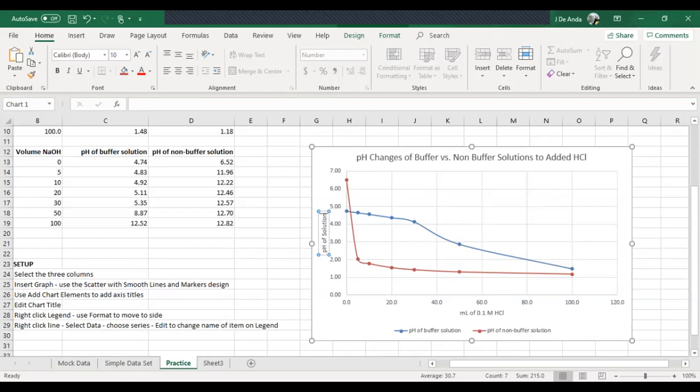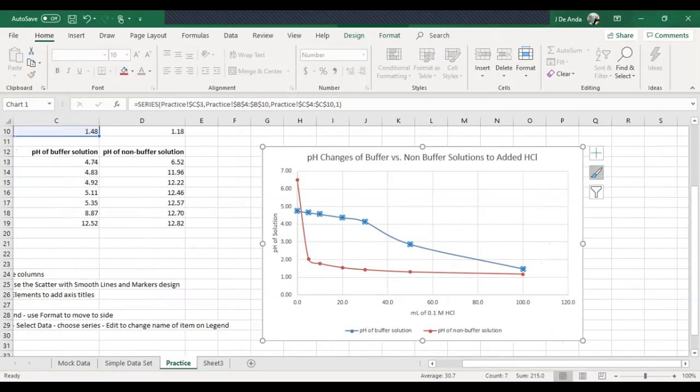All right. So the other thing I want to do is, right now it's fine. This is pretty good. I would like to maybe change the markers. If I'm going to print this to a black and white printer, I might want to change the markers on these. And I think the way you do that is you click on the graph itself here, and then you can edit the format here. I forget where you do that. Anyway, you can change the markers from circles into X's or, I don't know, little check marks or whatever.